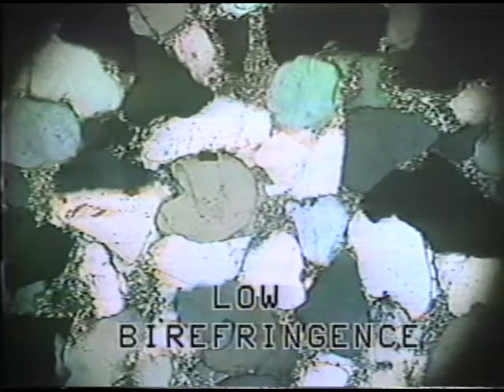And given the thickness of the mineral thin section, we can infer then the birefringence of quartz as approximately 0.01 birefringence. So this is a low birefringence, as exemplified by the mineral quartz and estimated by the interference color.